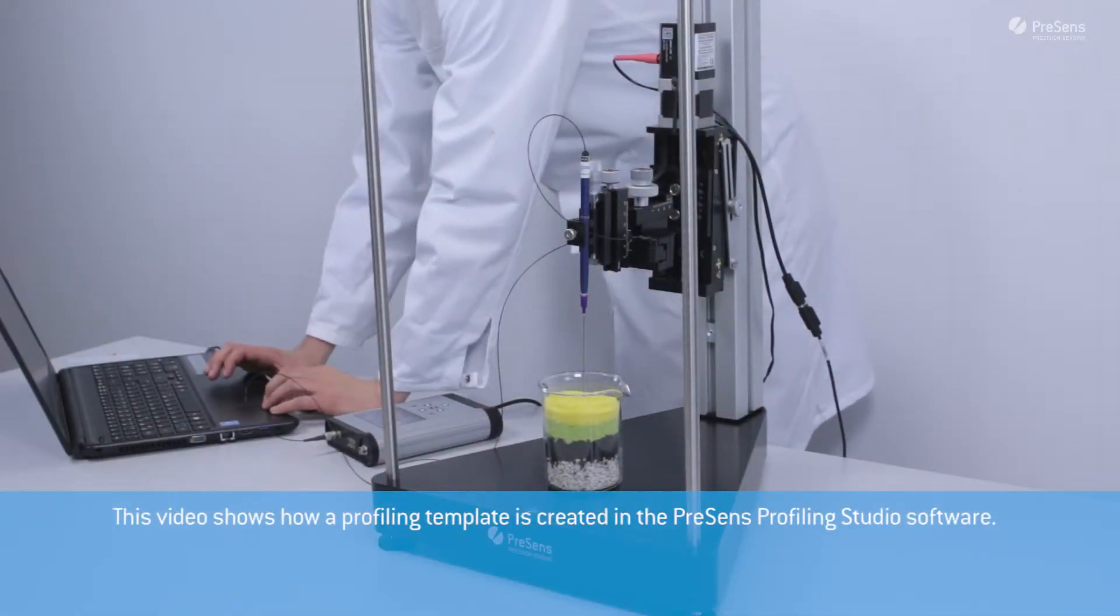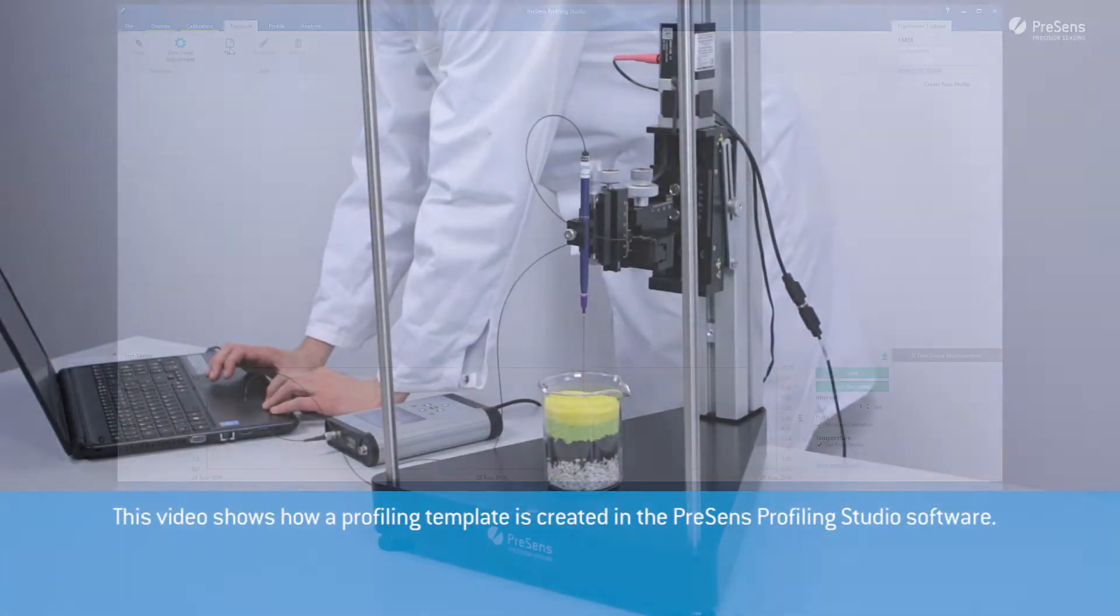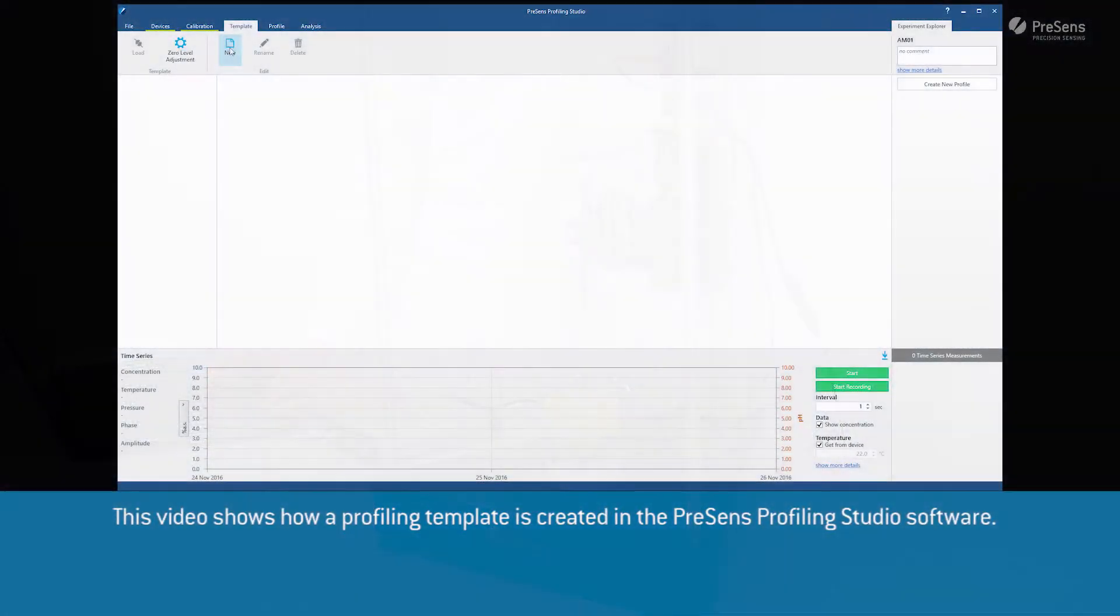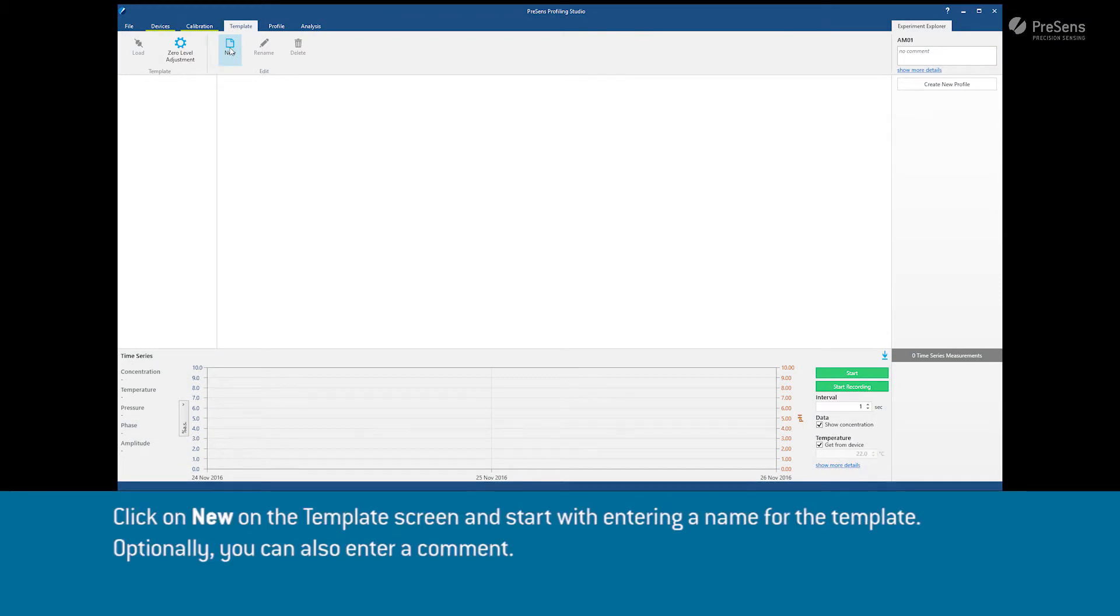This video shows how a profiling template is created in the PreSens Profiling Studio software.